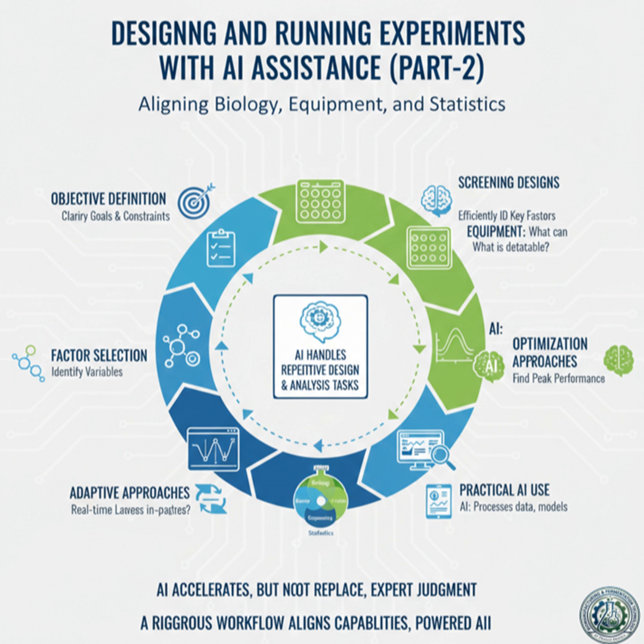The notes mention using AI to generate run tables that are CSV ready, which I have to say, for anyone who has manually typed experiment settings into equipment software, that is a blessing. Oh, it's a huge time saver. But the really interesting part is the example prompt they provide in the lesson. What's the prompt? It's simple.